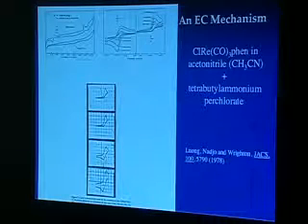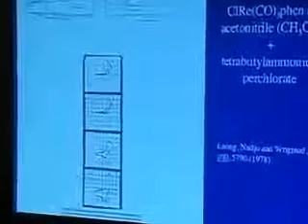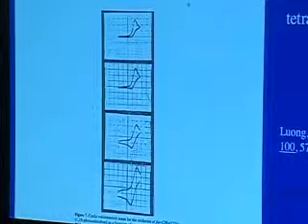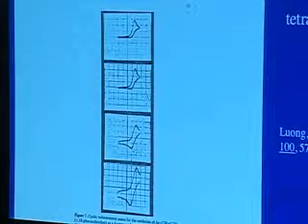Anyhow, so we start here, and we're starting at, I believe it's 1 volt per second, 2 volts per second. I believe it's 20 and 50 volts per second as we drop down there, and we're a little off the screen there. Yes, I'm right, 20 and 50 volts per second. Anyhow, 1 volt a second, again, you can see it. There's no return peak as far as one can discern. But when you get to 2 volts per second, you start to see there is a little bit of a return peak that's starting to show up there. And by 10 volts per second, it's very clear there is a return wave there. And at 50, 20, whatever I said, I think it's 50, it looks pretty reversible now.